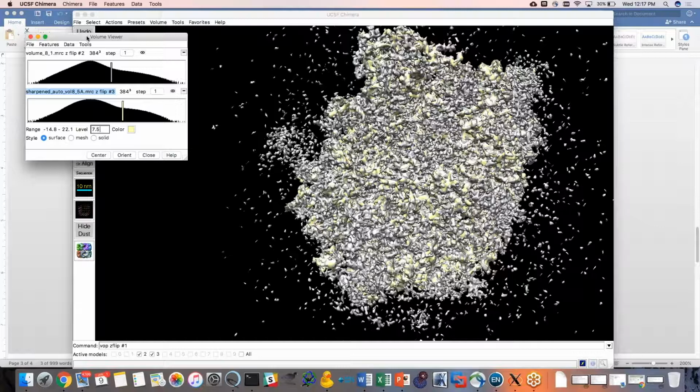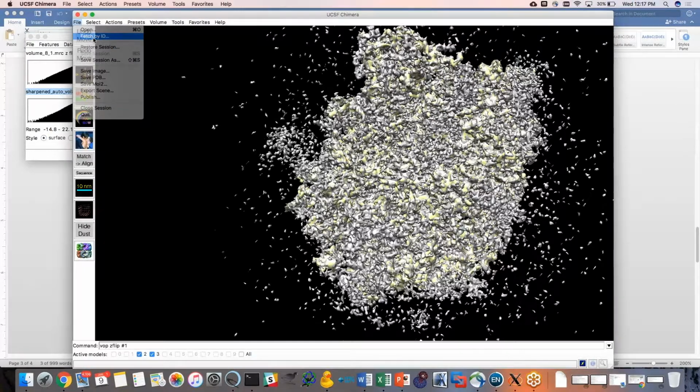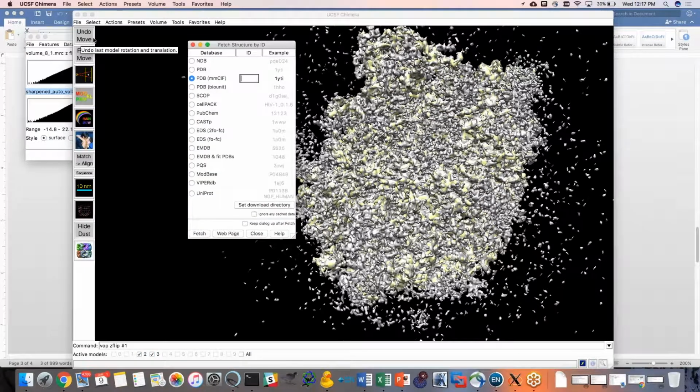So, all right. Now we are going to load up the very beautiful, final, polished, sharpened, masked, heavily processed deposition that Dimitri and Dario made, ready for publication. So this was just an initial, quick half a day of work, and this was not the entirety of the data set that we gave you in CryoSPARC.